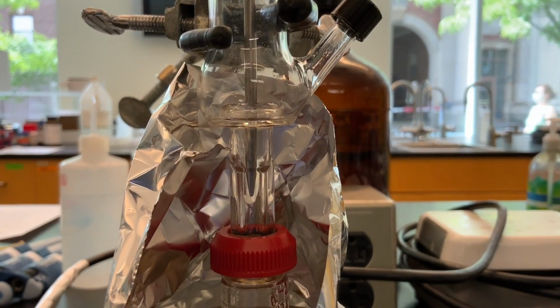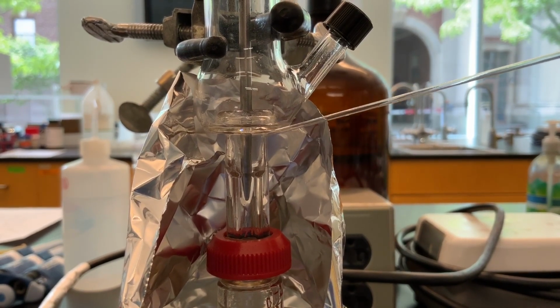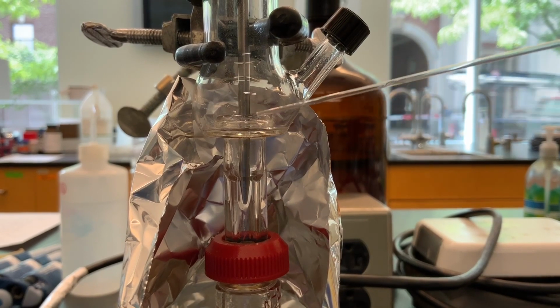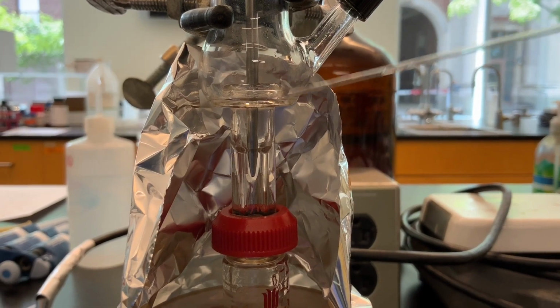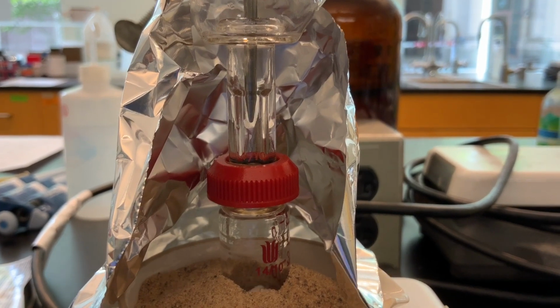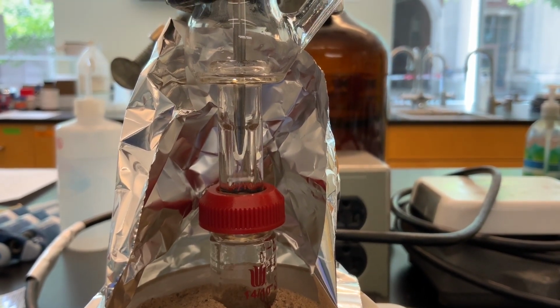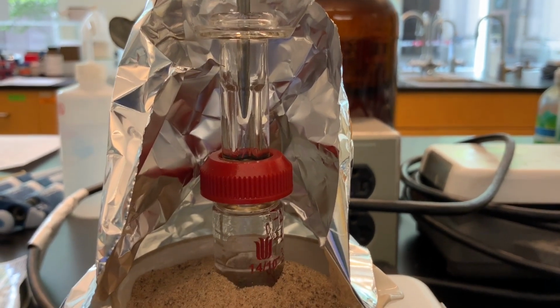All right, so now we're collecting fraction 3. We can see now once again that the distillate is coming over, so the vapors are condensing on the cooler area of the glassware and coming back down, or they're just sort of falling over at that little bevel point right there. And very clearly, it's pretty hot down there. Look at the toluene just boiling, sort of making its way past that thermometer pretty rapidly. Temperature right now is 105.5 degrees and going and climbing.